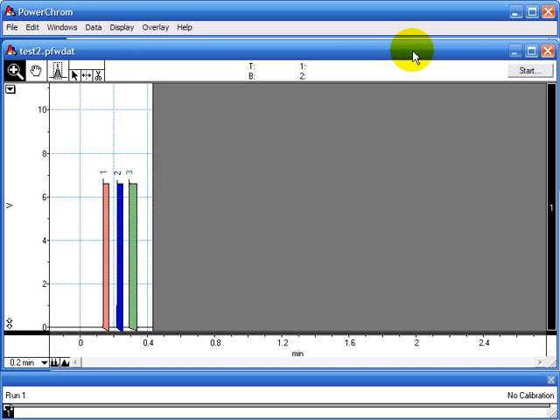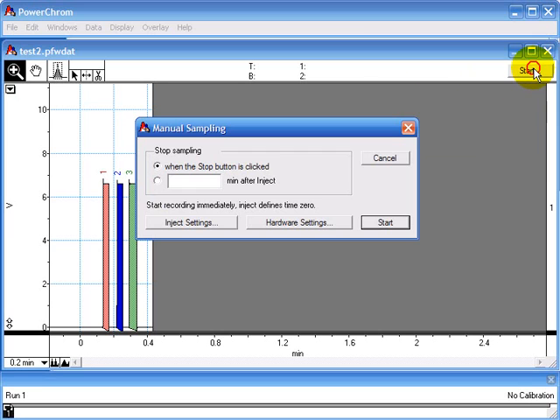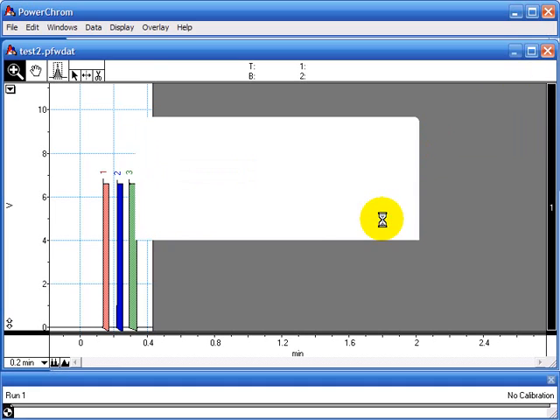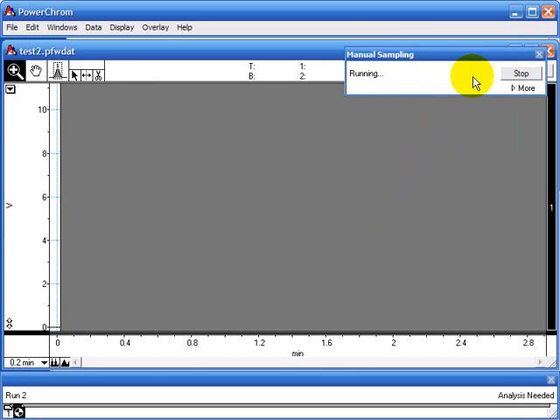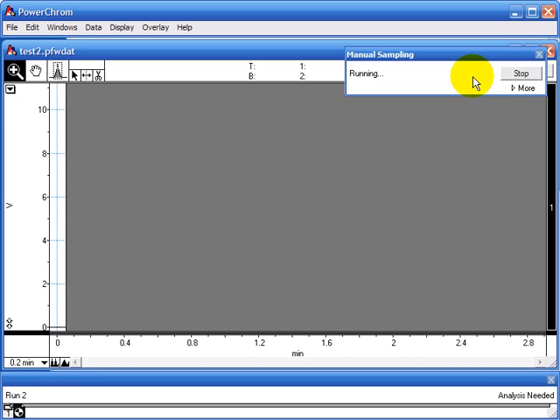If you want to collect a new injection, you just click on start. And when you're ready to inject, you click inject and collect some more peaks.